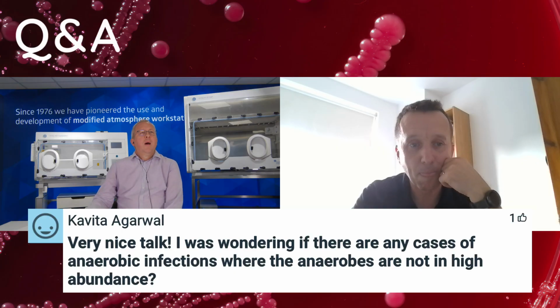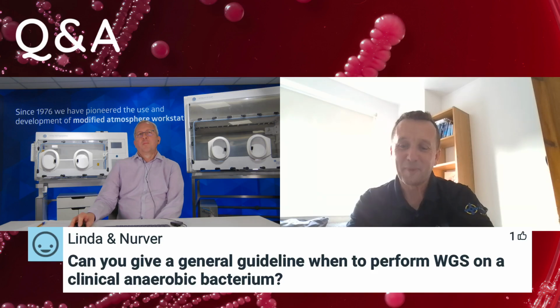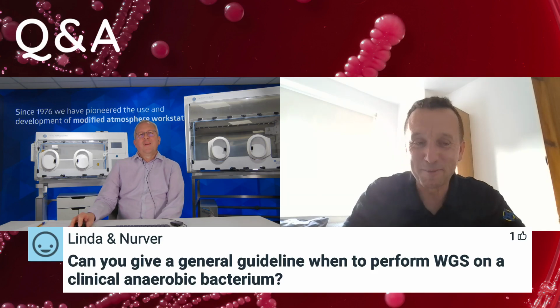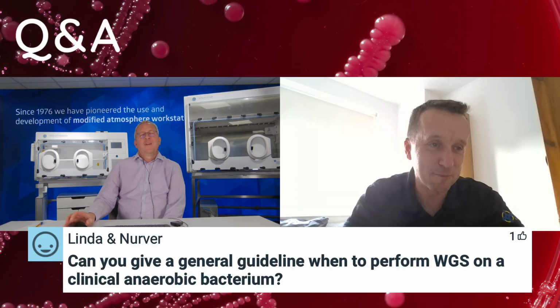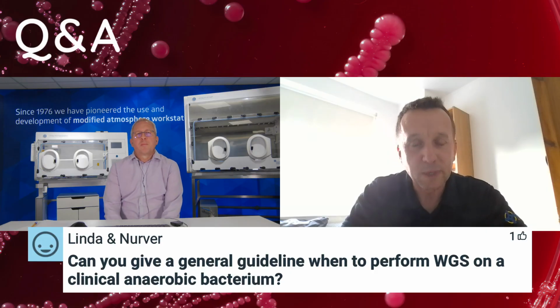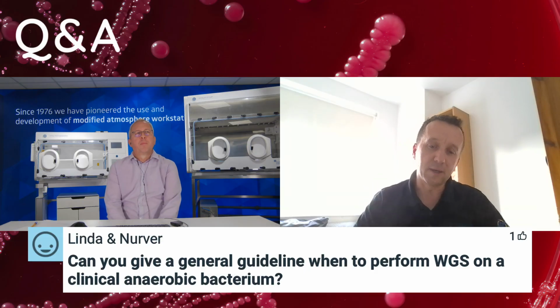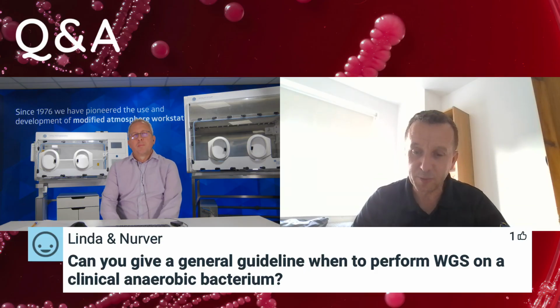Yeah, of course. Can you give a general guideline when to perform whole genome sequencing on a clinical anaerobe? That's something we're working our way through at the moment. So I think we focus a lot on Bacteroides species, Bacteroides fragilis particularly. Bacteroides fragilis is our most common pathogenic anaerobe in monomicrobial infections and in bacteraemia.